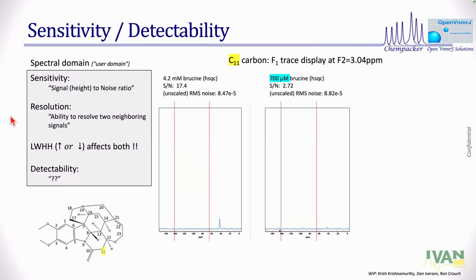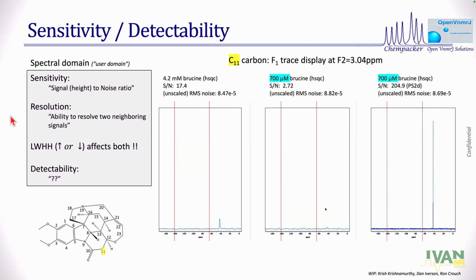Ideally, because this peak right here is also about the same, but that's actually a noise. So you can do this. Now, the same thing, I process it differently.